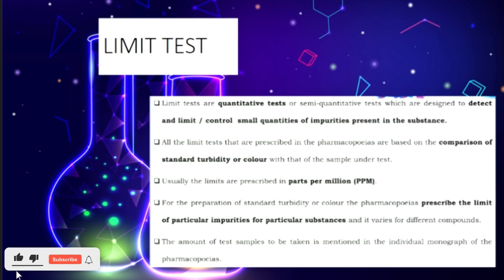For example, you're taking some Kellogg's in the morning, so they will usually test for any impurities or chemicals present in that Kellogg's, so that when you take it you will not get any poisoning or allergy from it. So this limit test, how do they find this out? You may have a doubt, right? This is based on the opalescence or turbidity of the sample.